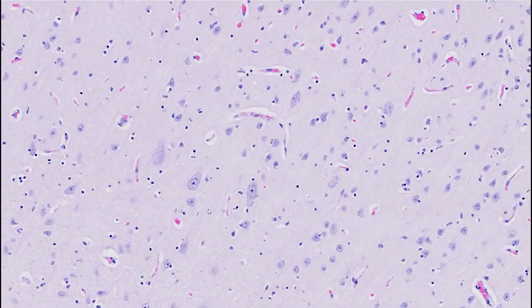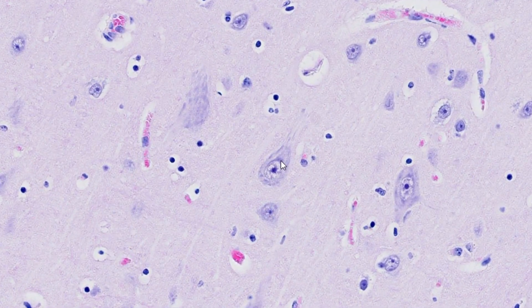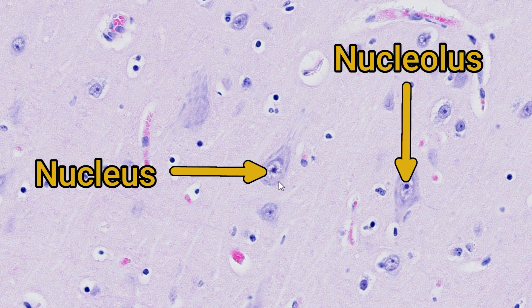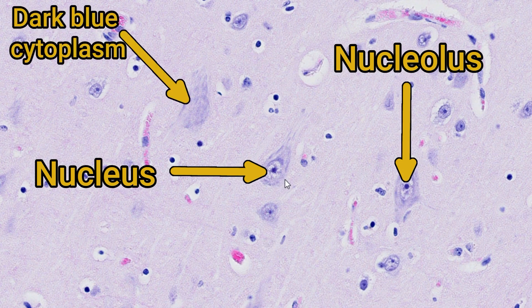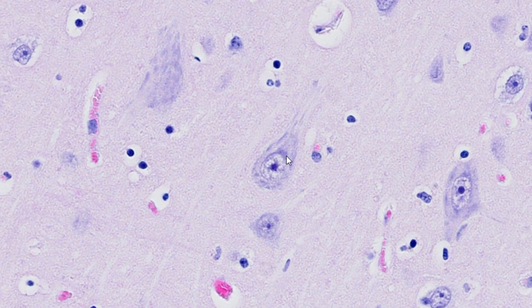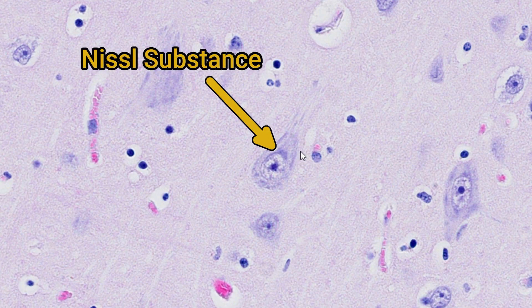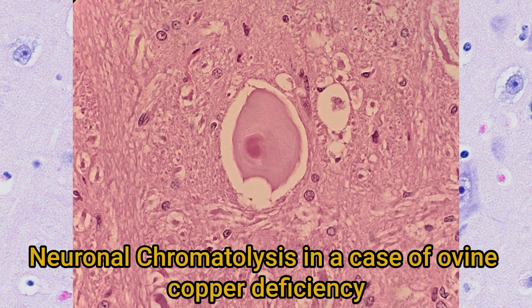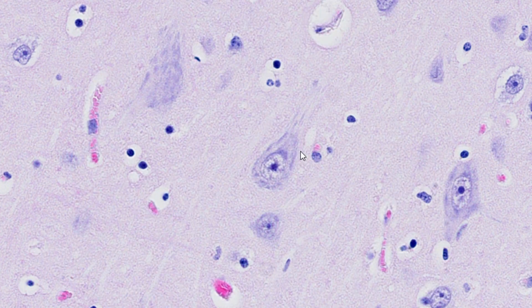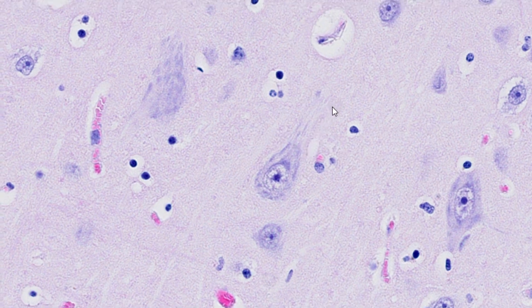Neurons have quite distinctive features. They have large nuclei which often have very dispersed chromatin and a prominent nucleolus. The cytoplasm is quite dark blue due to a large amount of RNA present - this is called Nissl substance - and loss of the Nissl substance can be a sign of early neuronal degeneration, an appearance known as chromatolysis. Sometimes if the neuron is cut in the right section you'll be able to see the axon extending away from the cell body.